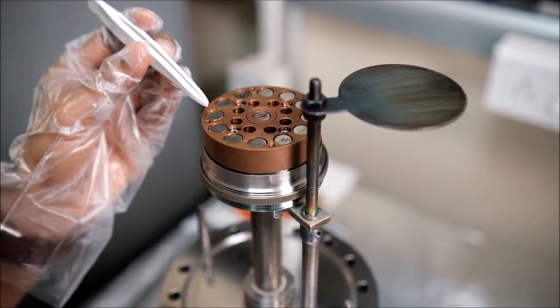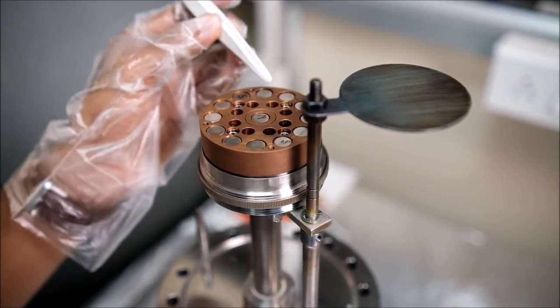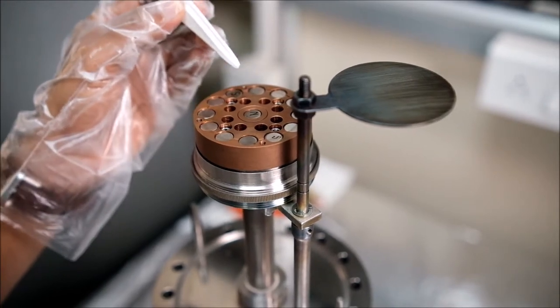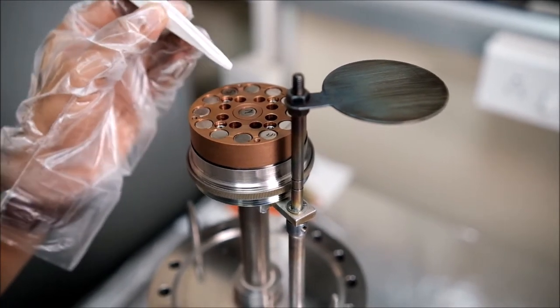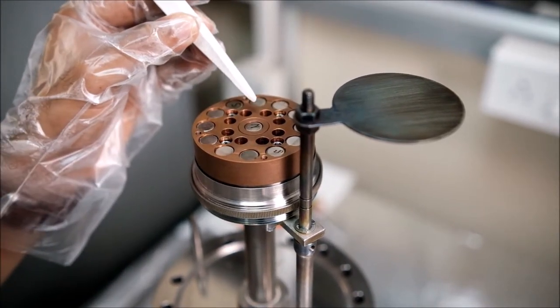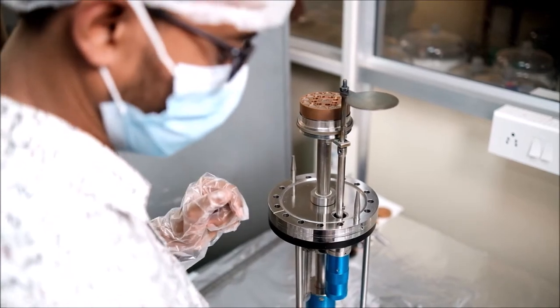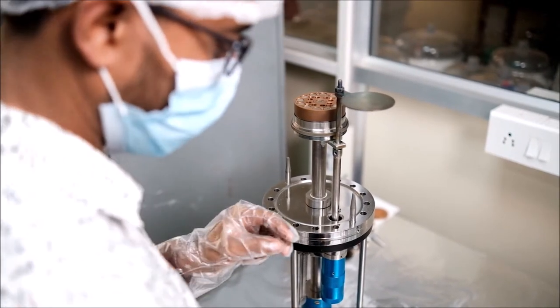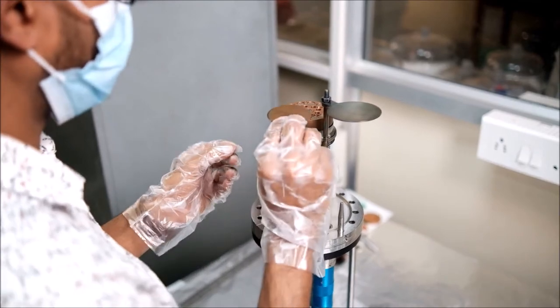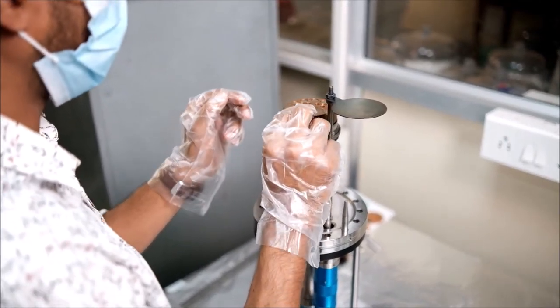Because these electrons are mostly surrounding this part and getting most of the energy here, most of the argon gets ionized at this area only and most of the sputtering also happens in this part only. Now we will attach the target onto the gun. First, we will use a back plate and on top of it we will attach the target so the target material does not contaminate.